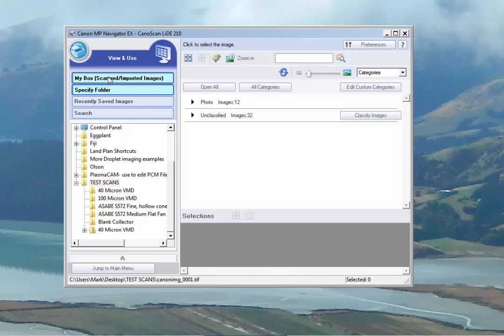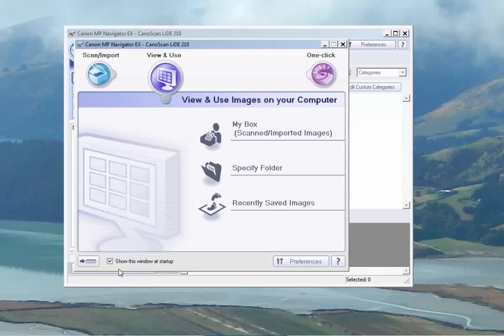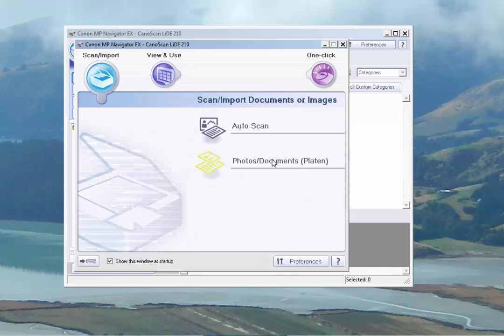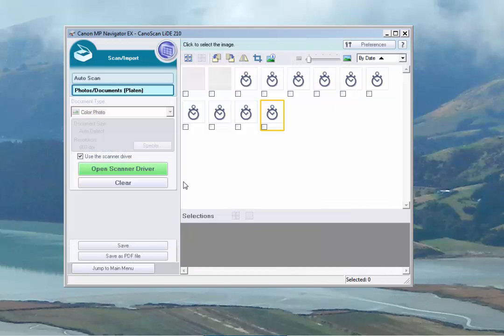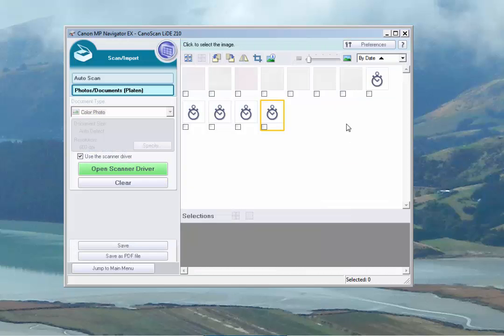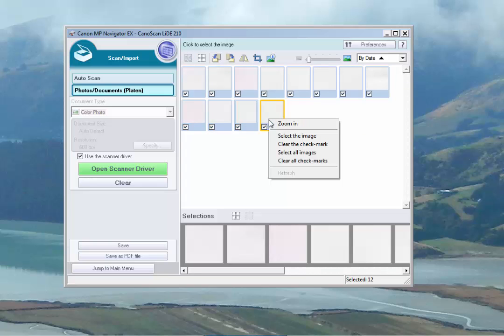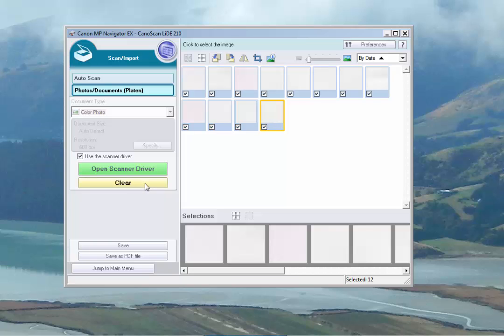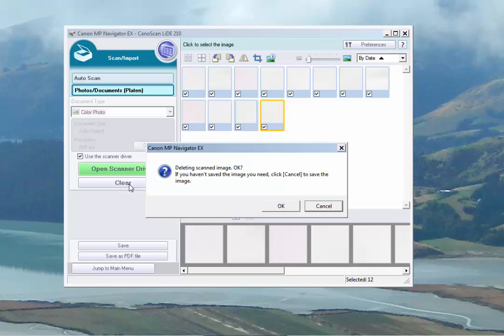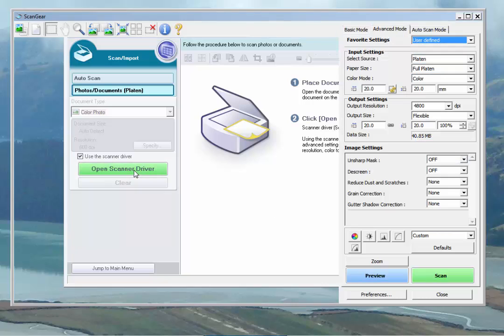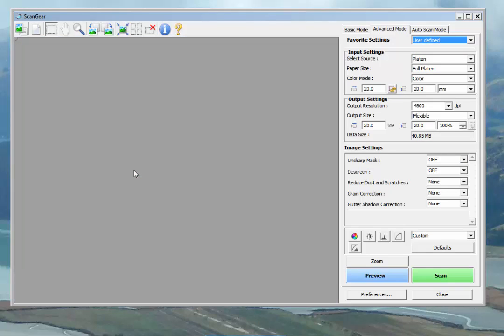We need to get back to the main menu. So we'll jump back to main menu. Back to scan import. Photos, documents, platen. While we're here, we'll go ahead and select all and get rid of these, because we're not going to work with these anymore. And they are saved. So the housekeeping done. Open the scanner driver. And we're back to where we started.